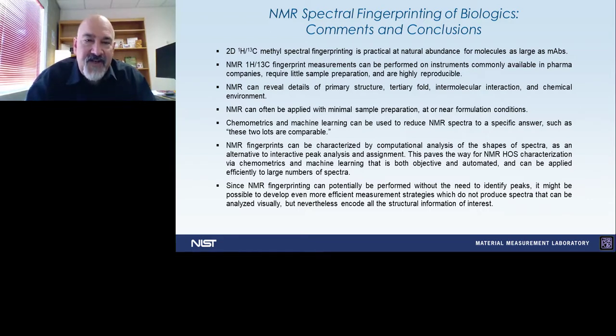So in conclusion, I hope you've been convinced that 2D proton carbon NMR spectroscopy is practical to perform at natural abundance on molecules as large as monoclonal antibodies, and we can get a wealth of information that's useful in the development and manufacturing of biopharmaceuticals.